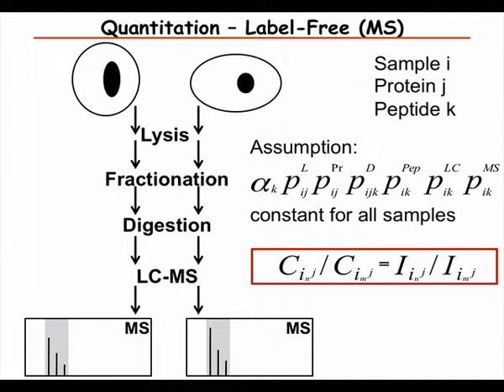And then what often happens, let's say you have a protein where you measure many different peptides. You're going to, of course, get slightly different ratios. And you're sometimes going to have outliers. And it's still a discussion of how to combine these different measurements from the same protein in a good way. So sometimes you can explain why a peptide should be an outlier.